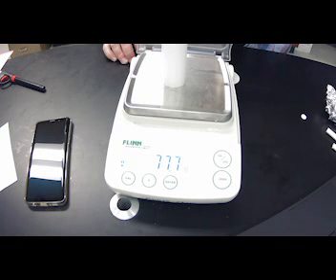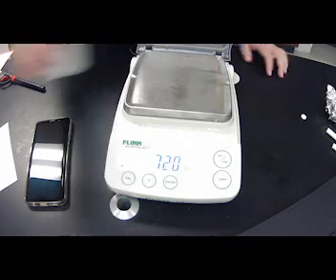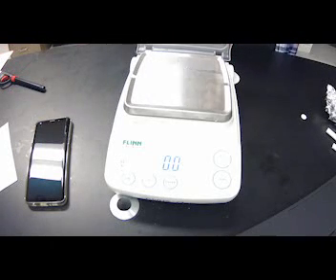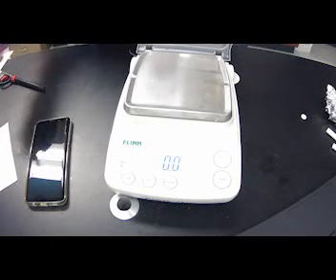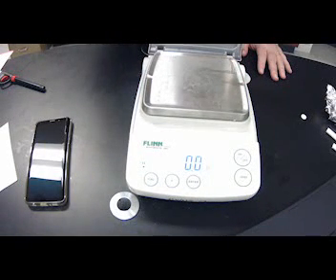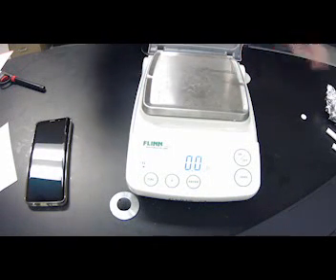F. Okay. Next thing we're going to do is we are going to do how much is in your name. We're going to do a crayon, and it's going to be my name and chalk. So the first thing we're going to do is we're going to do the crayon, and you should be now here on procedure 2. And we're filling out this data table to answer these questions.